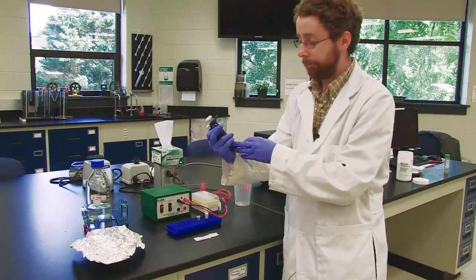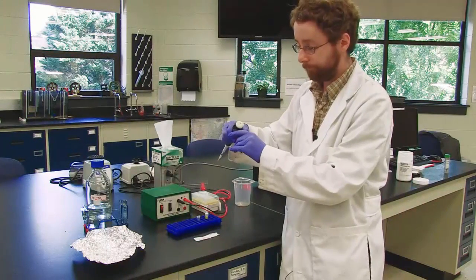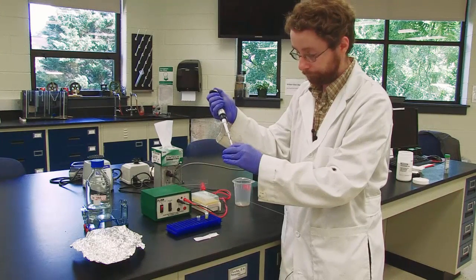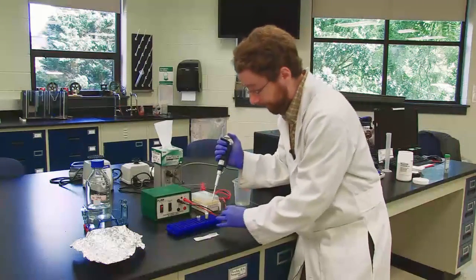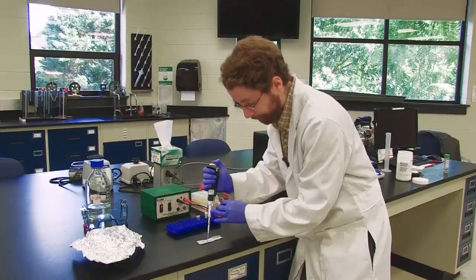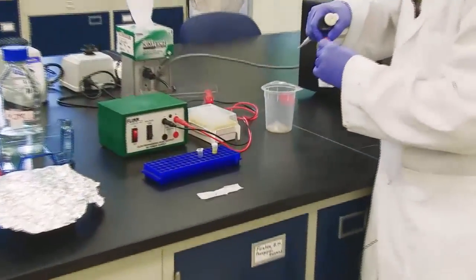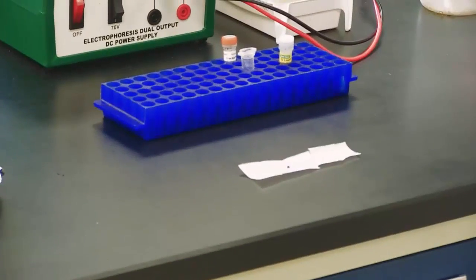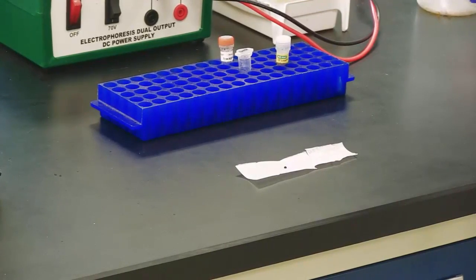I'll take my micropipetter and set it to 4 microliters. And I'm going to add the loading dye to a piece of parafilm. I then readjust my micropipetter for 20 microliters.